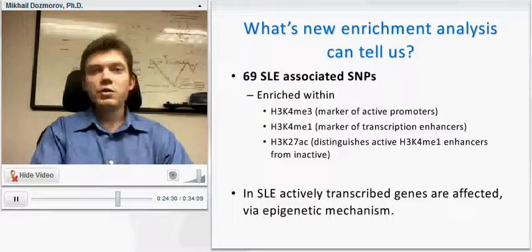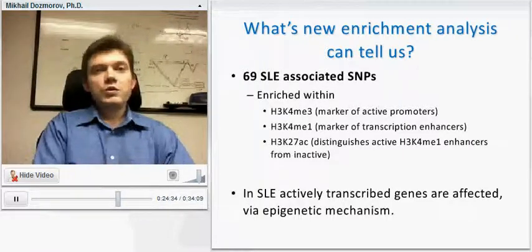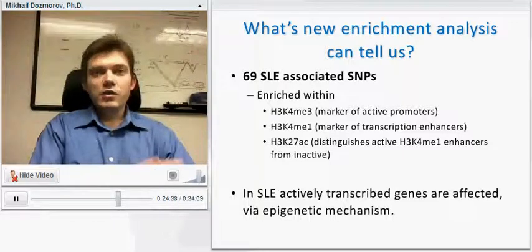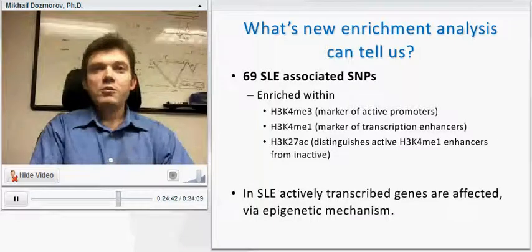We can go downstream and identify in which genes those SNPs are located, at which distance they are located, and what we are going to do with this information down the road.